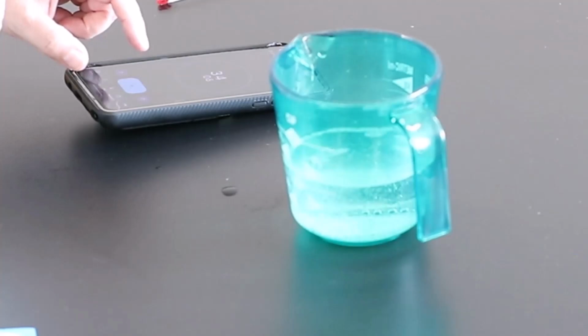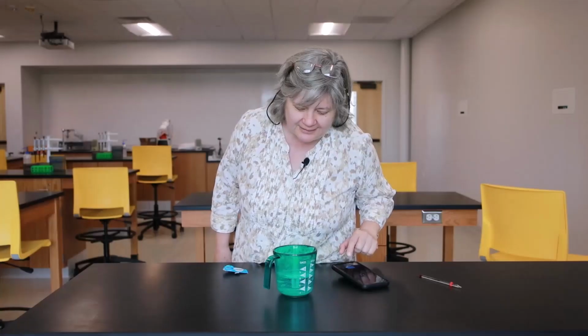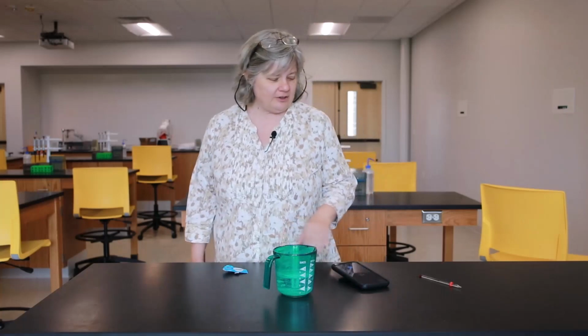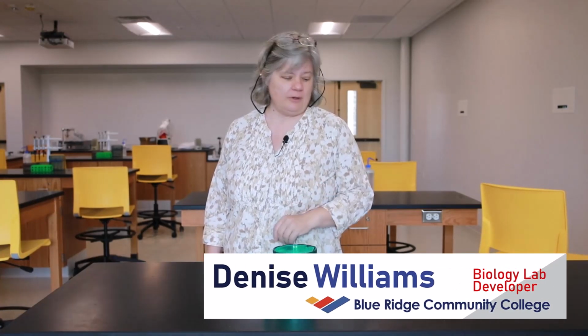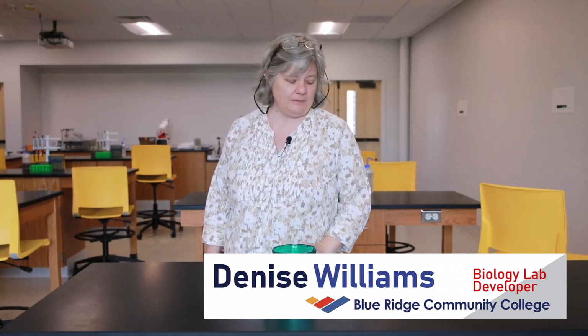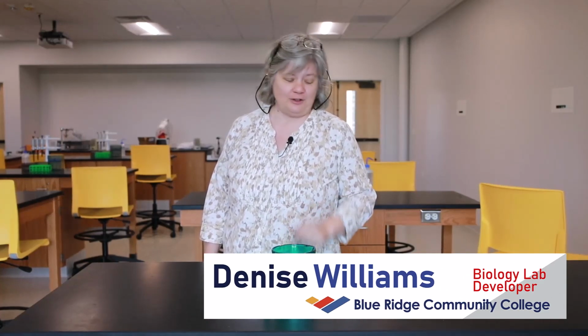I've got a little bit more. Okay, so I'll stop my stopwatch. I have 38 seconds there, so I'll record that amount. Again, I'm going to repeat this experiment using 3 trials at room temperature, 3 trials with cold water, and 3 trials at hot water, and we'll take the average of those, okay? Once you have your data collected, I'll show you how to graph it.